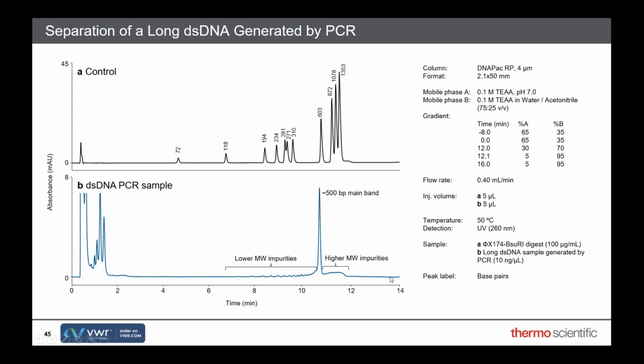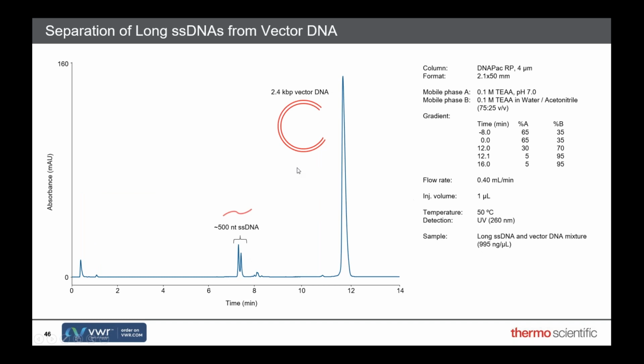And if you've got other impurities, where this differs from ion exchange, proteins stick harder. So the proteins will come out in the wash. And again, it's another example where you've got a vector. In this case, the double-stranded vector's been cut to release the DNA that you actually want. And the DNA has actually been unzipped to produce single-stranded DNA. So you can see the two 500 long DNA strands there separated as well. So that's an example of how you can look at what you've actually got in your plasmid and how you can make sure what you want is actually in there.